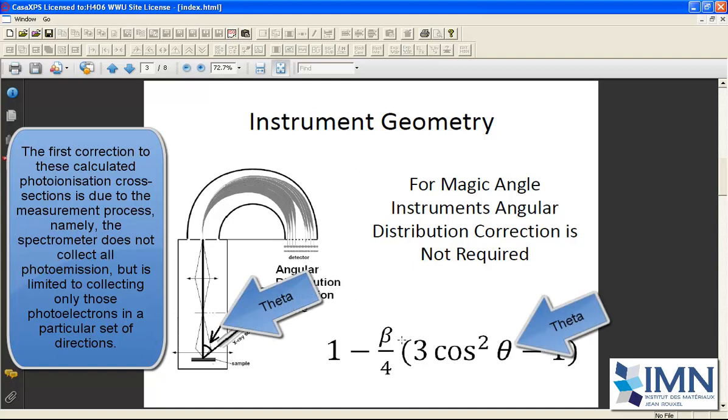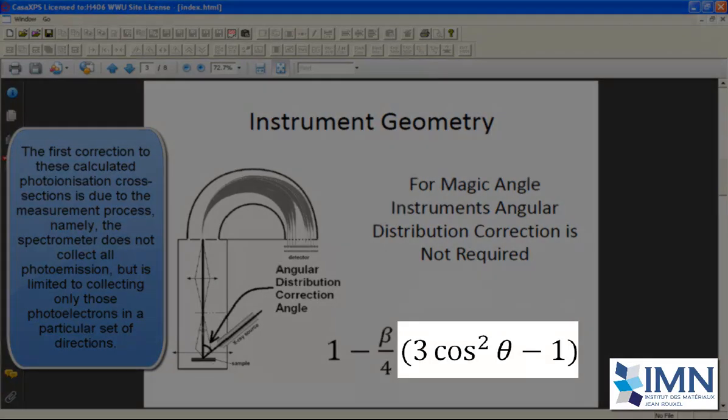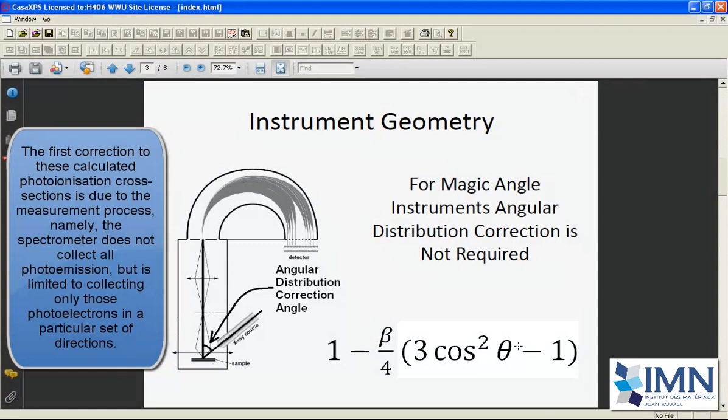And there is an expression here and a calculated value, this beta, that depends on physics. This angle theta here enters into the calculation in terms of this polynomial in terms of cosine theta. If we choose the angle between the x-ray source and the axis of the analyzer to be the so-called magic angle, then this term vanishes, and we don't have to consider this as part of the calculation of the peak intensity.